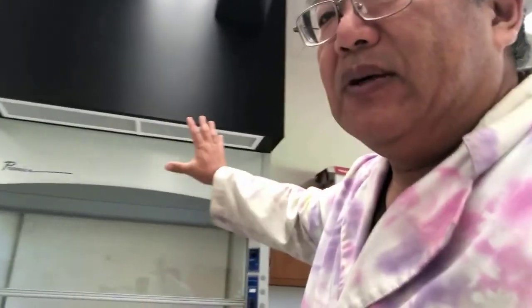This is the hood right here. It's actually called a fume hood, and it's designed to take out chemical fumes that are generated during an experiment. There'll usually be a beaker in here during the lab that you put your waste in, and then the rest of the process involves our lab technician, Austin, and he will dispose of the waste in the bottles down below.